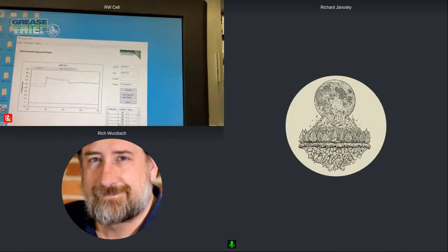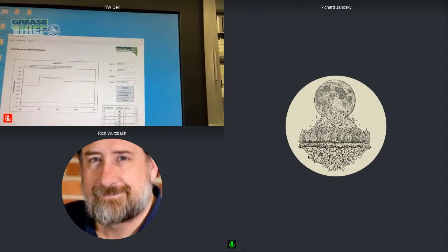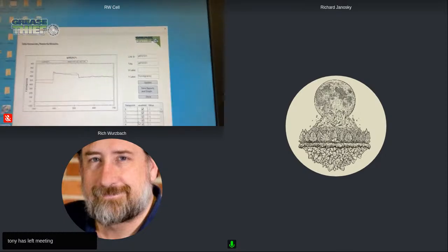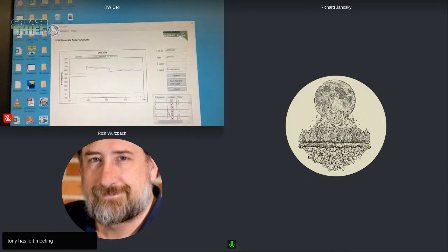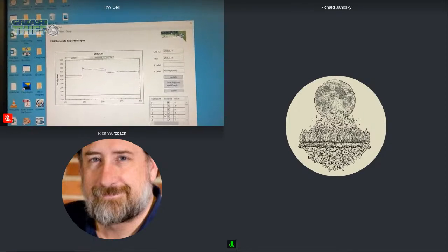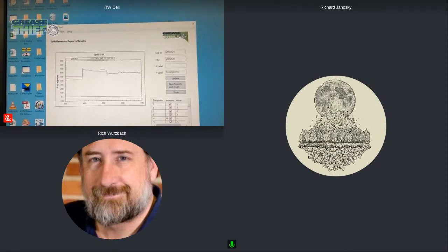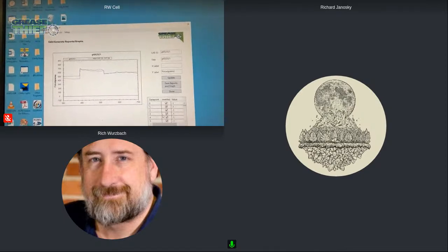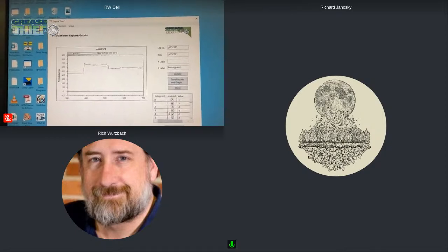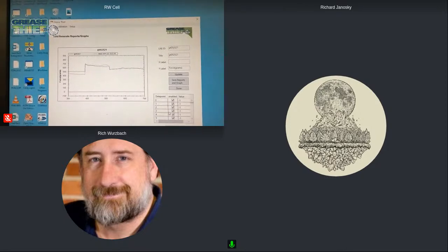So here we see this sample and baseline, and it might be hard to see, but that's because they're almost overlapping each other. You have a red line and a blue line there. Yep, and we can see at the beginning that the baseline's the red line. It took a little less force to extrude. The sample took a little bit more, but then once it got into the higher speed and the medium speed, they're just about a perfect match to each other.